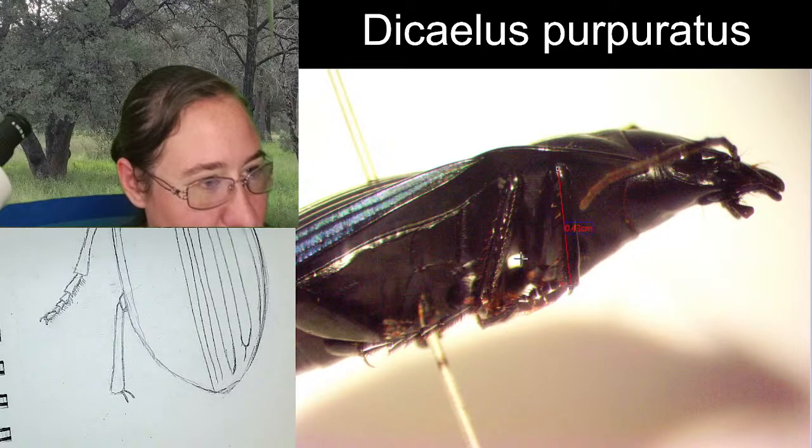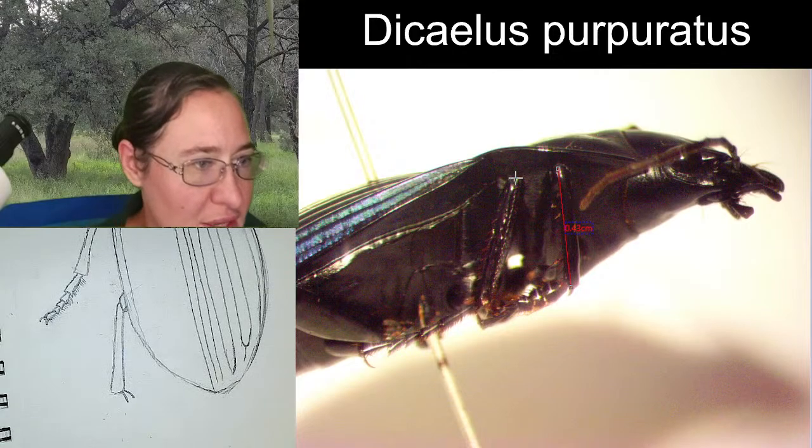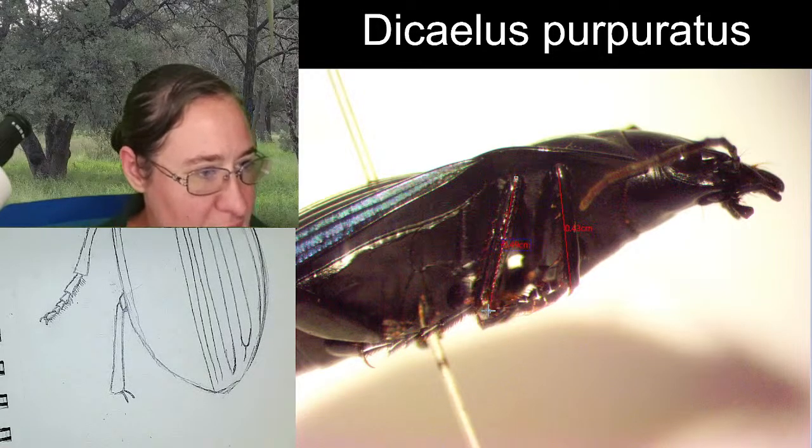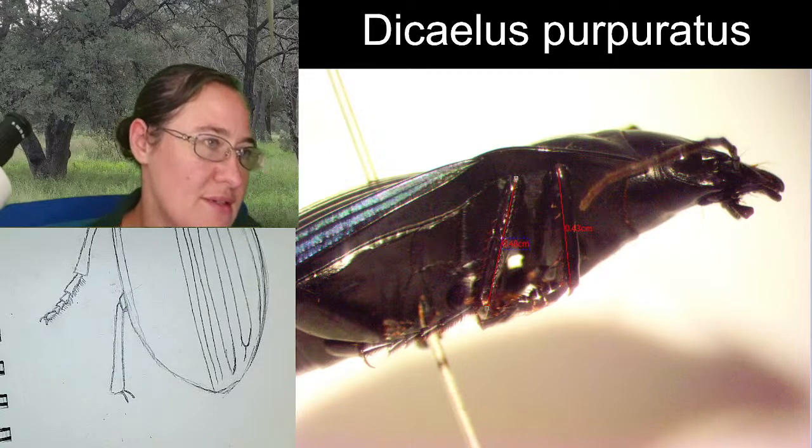The front leg tibia is 0.43 centimeters and the middle leg is 0.48 centimeters.